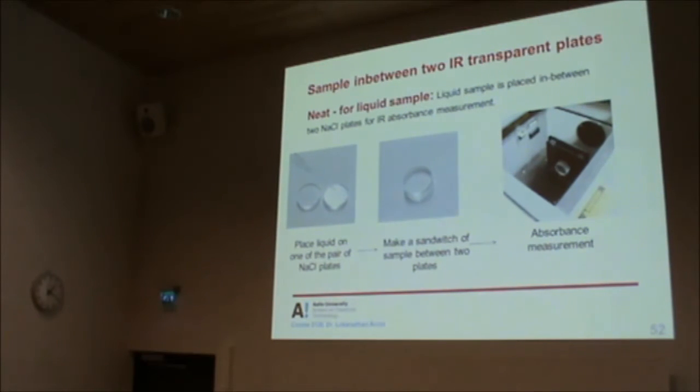Next, what if you have a sample that is liquid? Then what you do is you take a sodium chloride plate, you put a drop of the liquid, and you sandwich the liquid between two sodium chloride plates and you do the absorbance measurement.